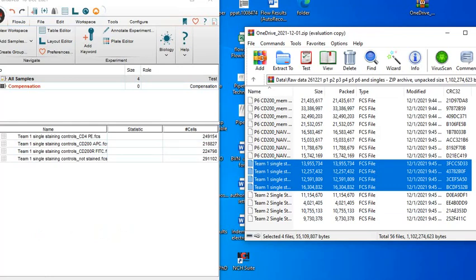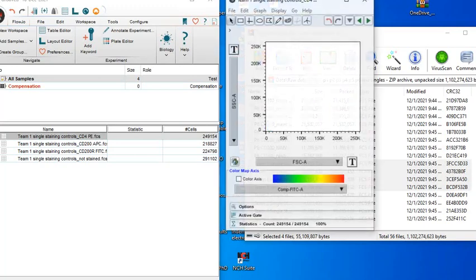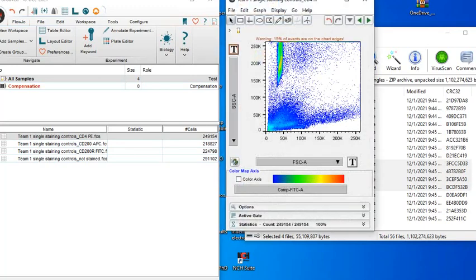The next process we're going to go about is trying to assess it. In everything you have the living cells, the cells that are alive, and those that are apoptotic. Basically, we are not looking for the apoptotic cells or debris. We are looking for the lymphocytes. So the next step we're going to do is get the lymphocytes.